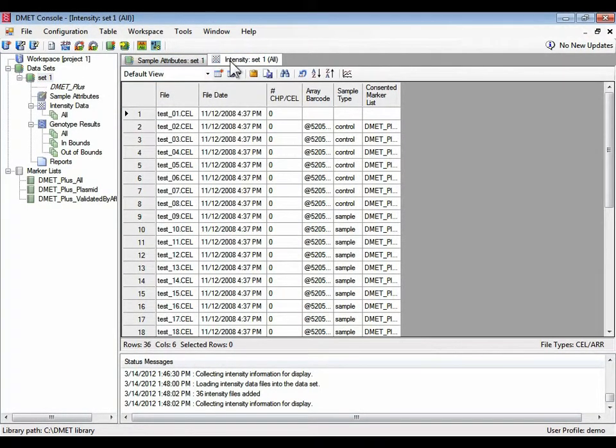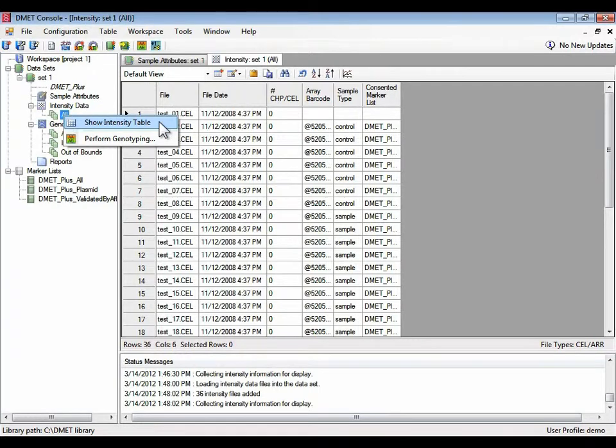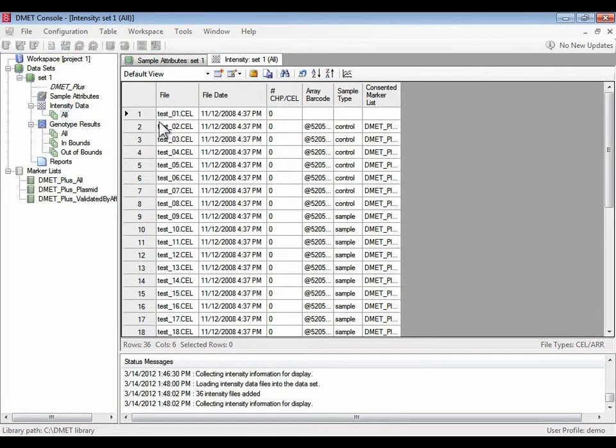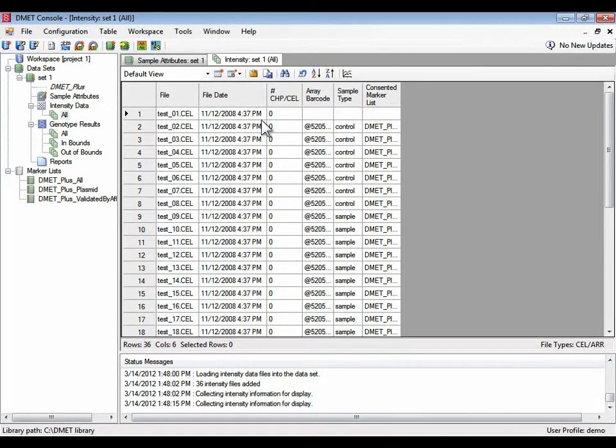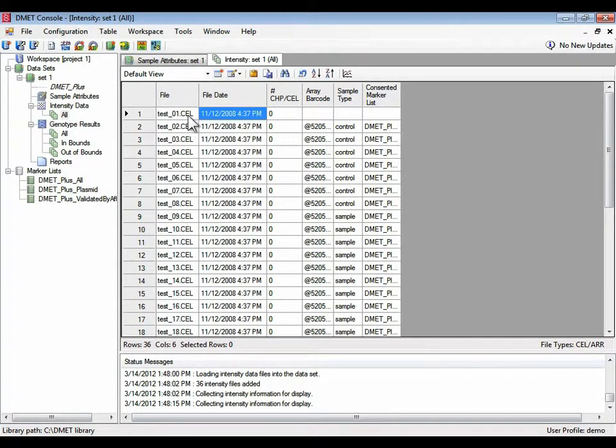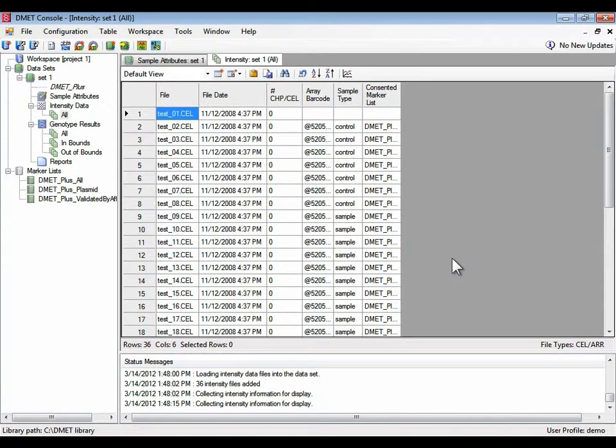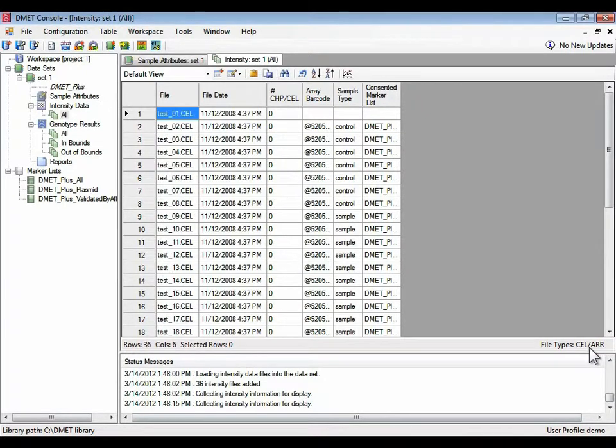And a new table opens up, which lists all the cell files that are available. The show intensity table is the same as this file that opens. So it has information not only about the cell file, as in when was it created, what's its name, but this table is collating information from other file types as well. In this case, it's also pulling information from the associated ARR file.